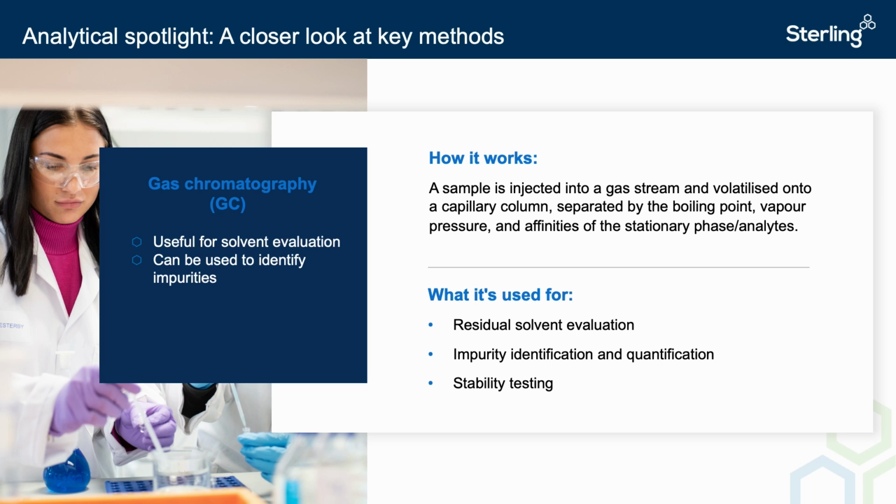Electron capture detection, or ECD, is usually used for measuring the electronegative compounds from an inert gas, determining the amount of halogenated or organic metallic compounds, and it usually uses nitrogen as a carrier gas.